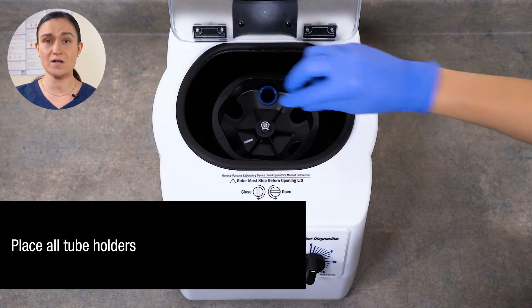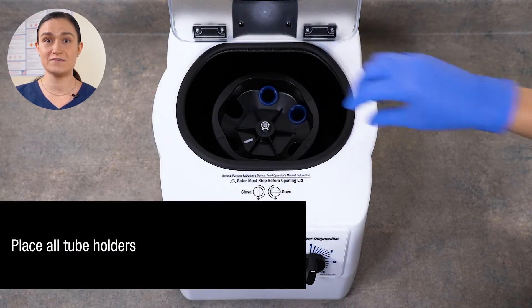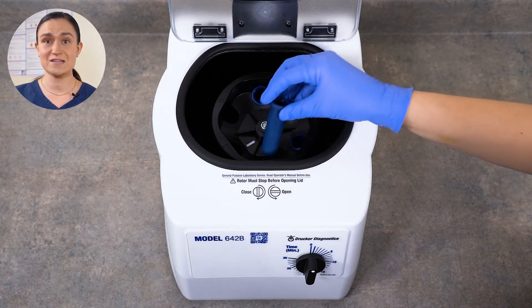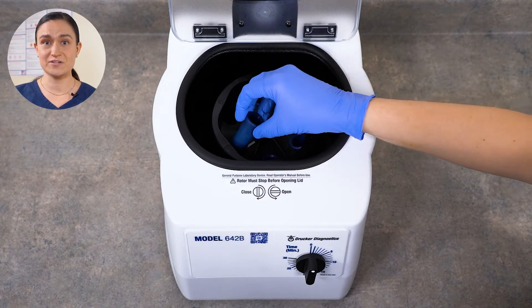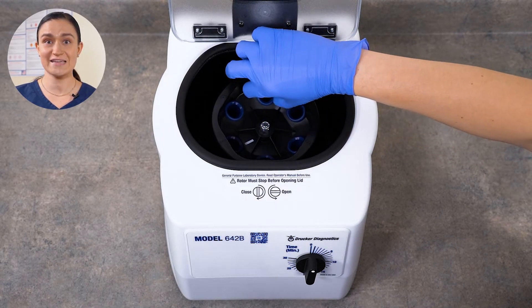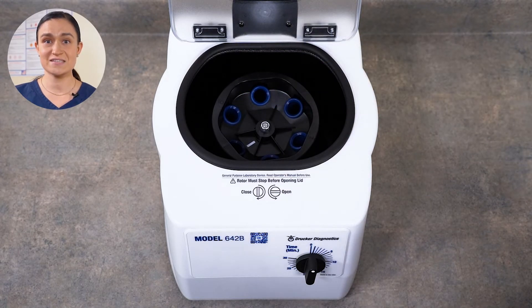You will need to place all 6 tube holders, even if you are not spinning 6 tubes. You can see the slots all around the rotor — place a tube holder in each. Properly seated tube holders can be moved slightly in their slots. This is by design and that's what allows them to rise into their horizontal spin position. They do not click or snap into place.